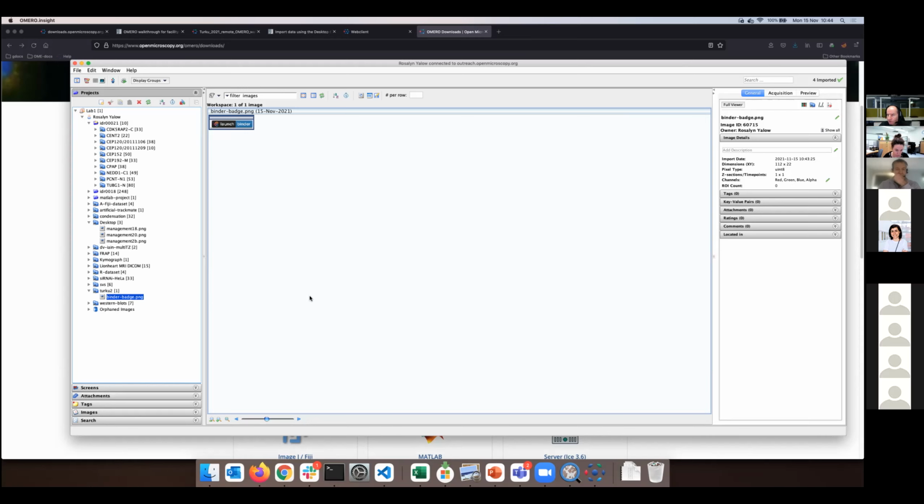You have nevertheless your own server in Finland, and you should ask the administrators in Finland about the server address mainly, and how your username and password is constructed and created, possibly with the cooperation of the IT with the institution in Turku. I'm sure Joanna knows much more about that than myself, but that's how things work.